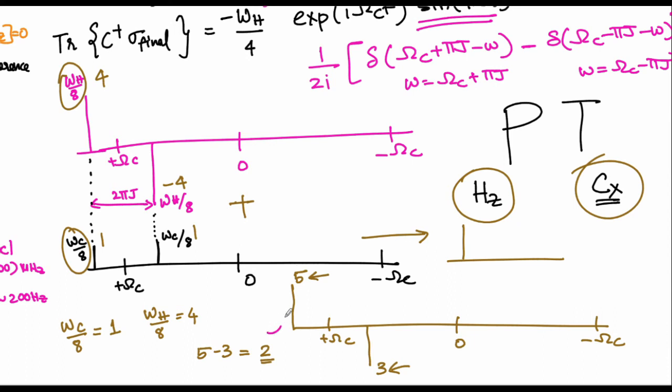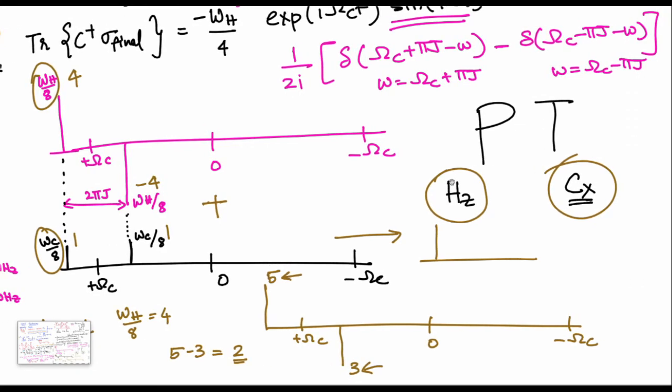The main issue if you have a plus and a minus resonance is that you could have another resonance that's plus and minus that will destructively interfere with it. Here we are just seeing one example of capital omega c, but in a real system you're going to have multiple carbons which could destructively interfere, meaning that you have a plus and a minus, and then another one could be a plus and a minus, and the resonance here would be completely missing. So therefore, INEPT, although giving you a very good sensitivity boost, might not be very applicable, and in the next module as we go forward, we will see how this can be converted.